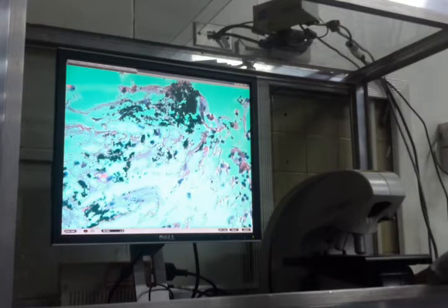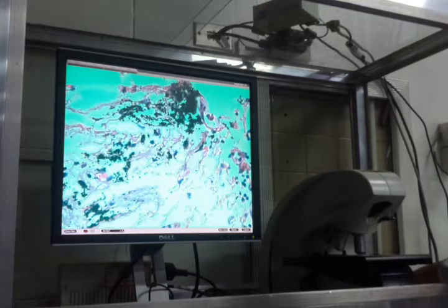Usually, this will be shown in the lung parenchyma, in the septa or near the fibrous tissue supporting the larger air passages. These are called anthracotic pigments or carbon pigments.